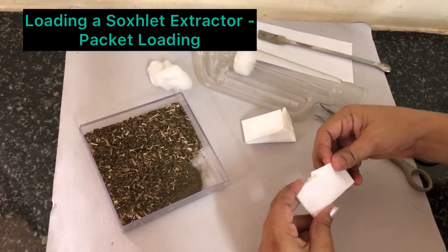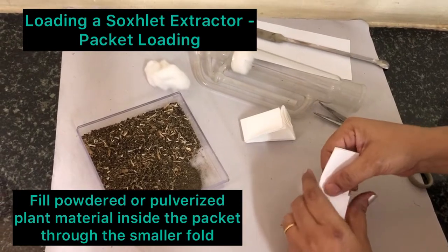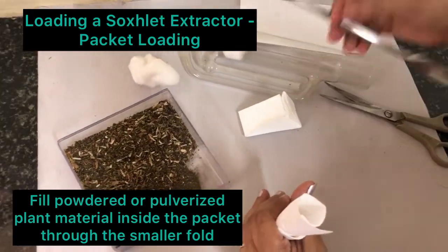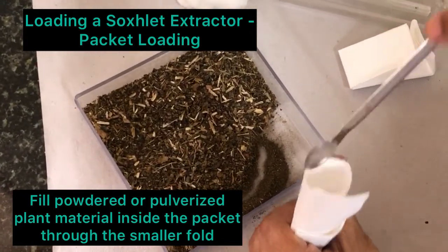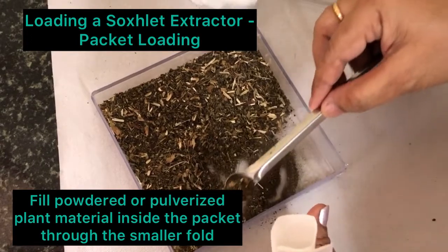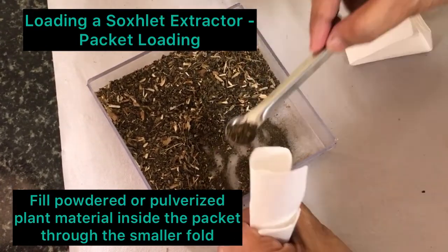Now we have to fill the plant material. Open the smaller end like this. Now this is for extracting powdery materials — powdery plant materials. A weighed amount of the powdered plant material you can load inside like this.